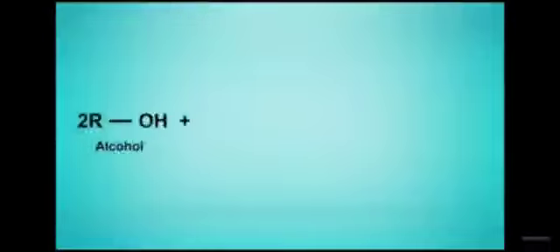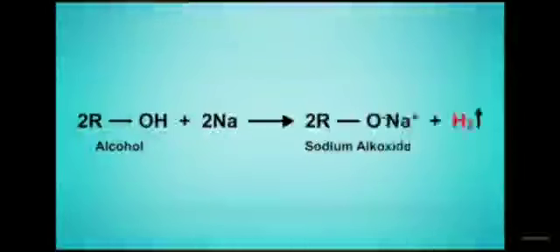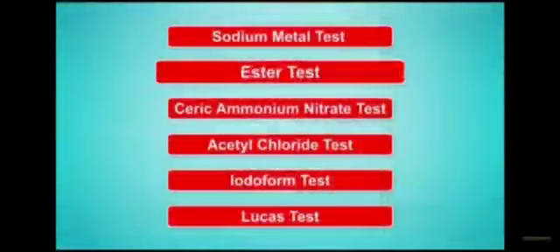Brisk effervescence due to the liberation of hydrogen gas. Alcohol reacts with active metals like sodium to produce hydrogen gas. This is the first test for the detection of alcohol.